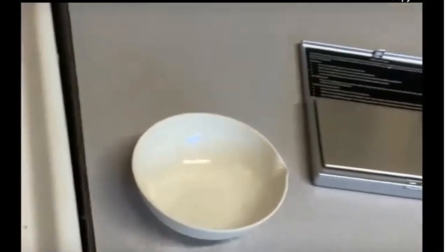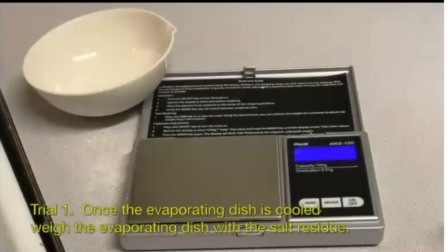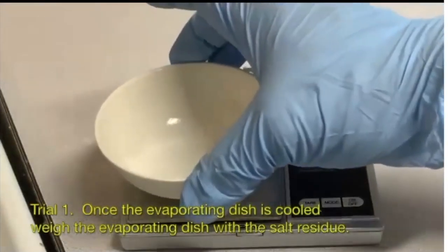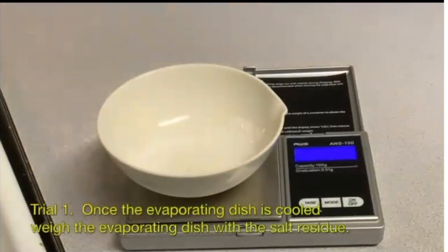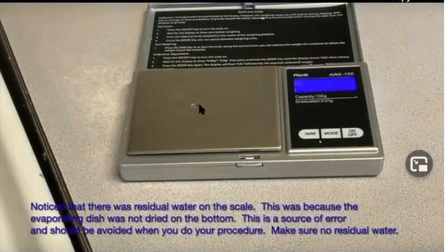So I'm just allowing it to cool. And you can see the salt residue right there. And I'm talking in the background. And then once I'm ready and everything's set and cool, then all I've got to do is weigh it. That will be recorded in your data sheet. And then you want to wash it and then repeat the whole process again. Notice there's some liquid water here, and that's because I didn't dry the evaporating dish in the bottom, so my results are going to be off. Don't do that, okay? Make sure it's completely dry.